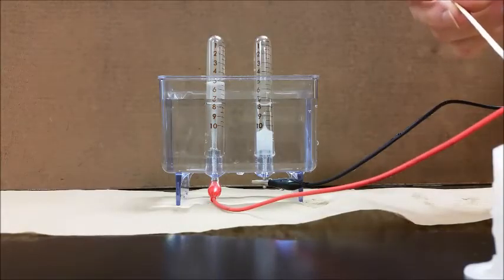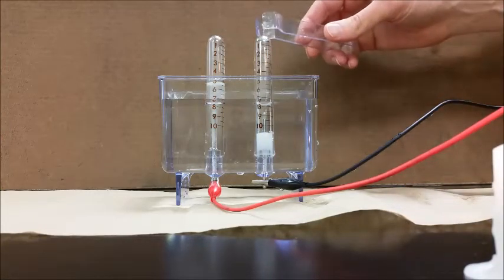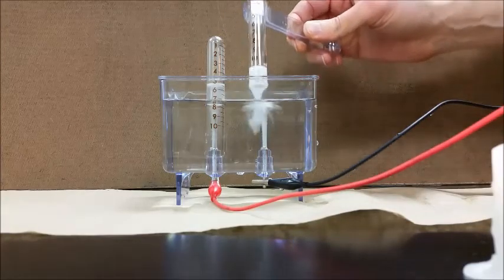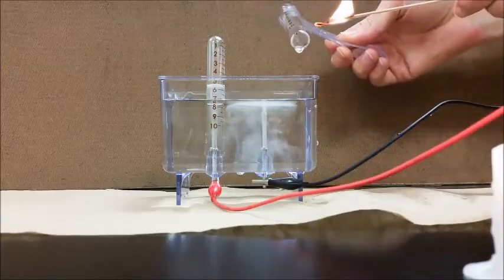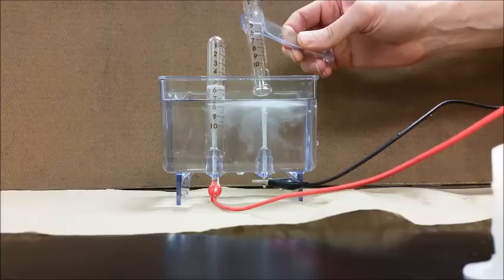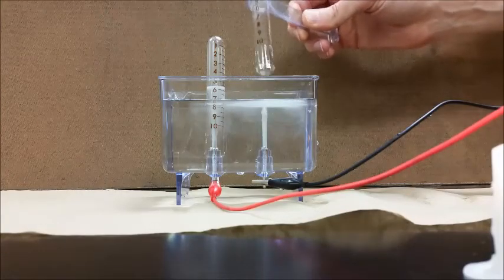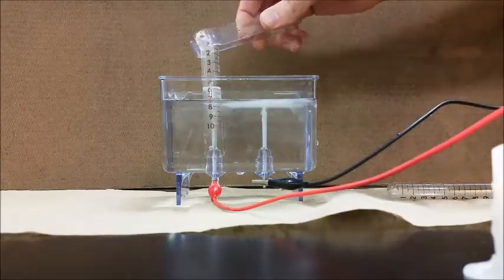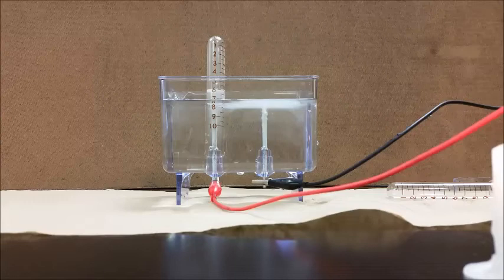Now we're going to zoom back out and identify these two gases using a splint test. I'll let the reaction keep going while I test this one, because I want it to fill up a little more. I'm going to take this tube, empty out the solution — and that little mini explosion there is indicative that we had hydrogen gas at this end. So we had twice as much hydrogen gas as whatever gas is in the other tube.